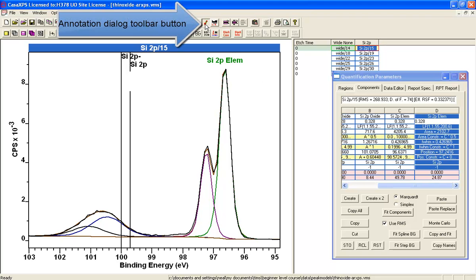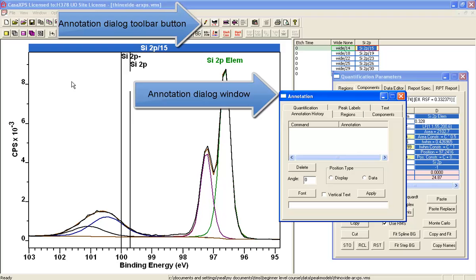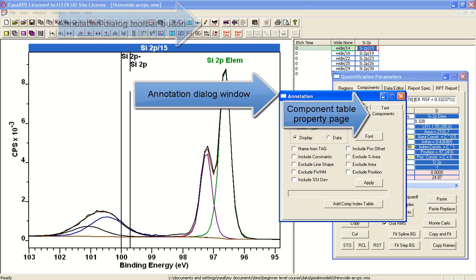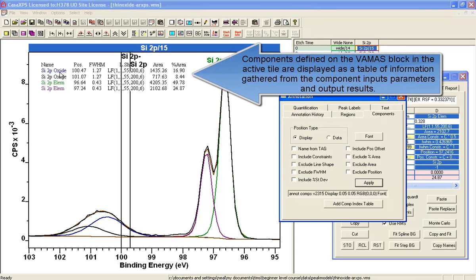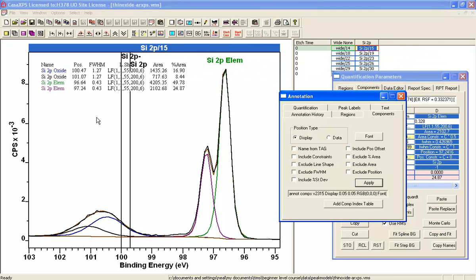We can see a table that will be positioned over the data by going to the annotation property page components, and if I just say apply, you can see that I now get a table showing me the percent area taken from these peaks, the area itself, the line shape that was used, full width at half maximum, and the position. So there's an example of a very simple peak fit that can be applied to data of this form.